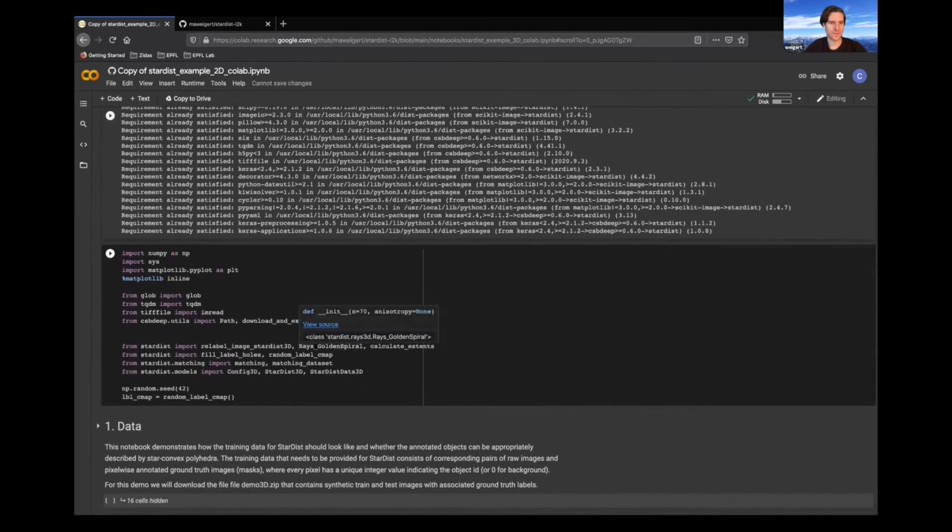Okay. So I will try to just go along, and if something on your side is not up to speed, I rely on you interrupting me, okay? Otherwise, I will assume I'm too slow.